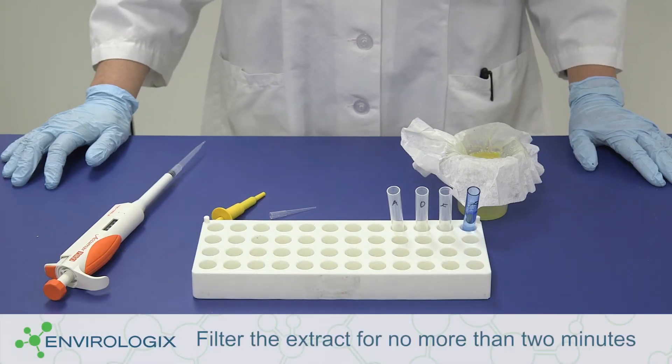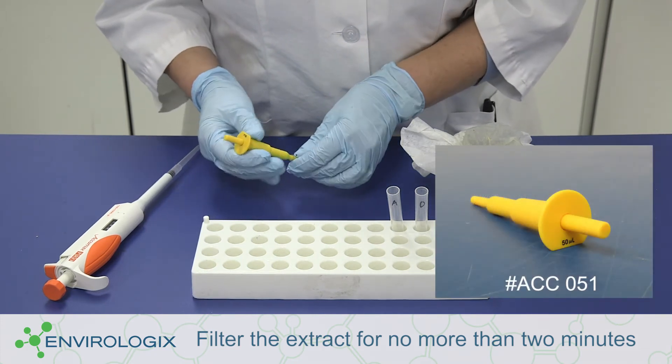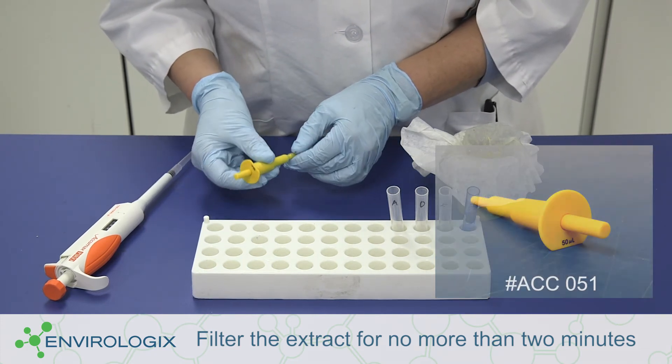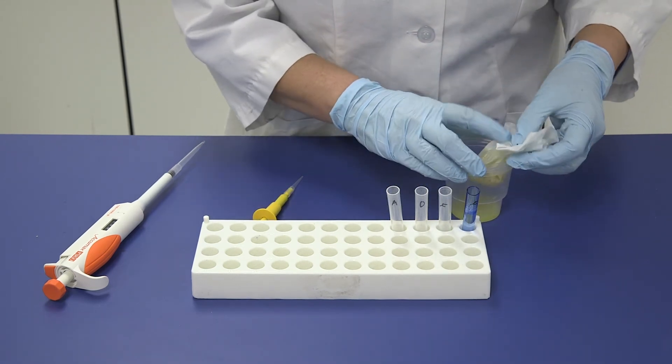Next, add the clarified extract. Place a clean tip on a 50 microliter pipette. Transfer one pipetteful of clarified extract to the blue dilution tube labeled F.